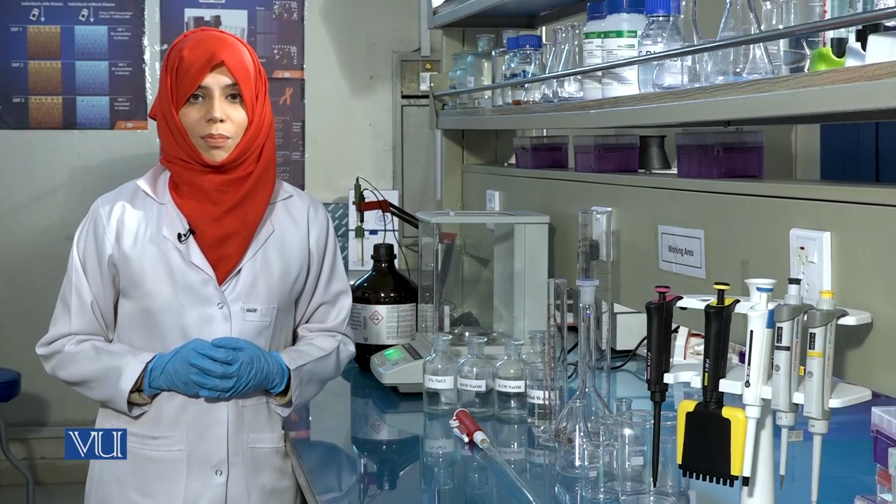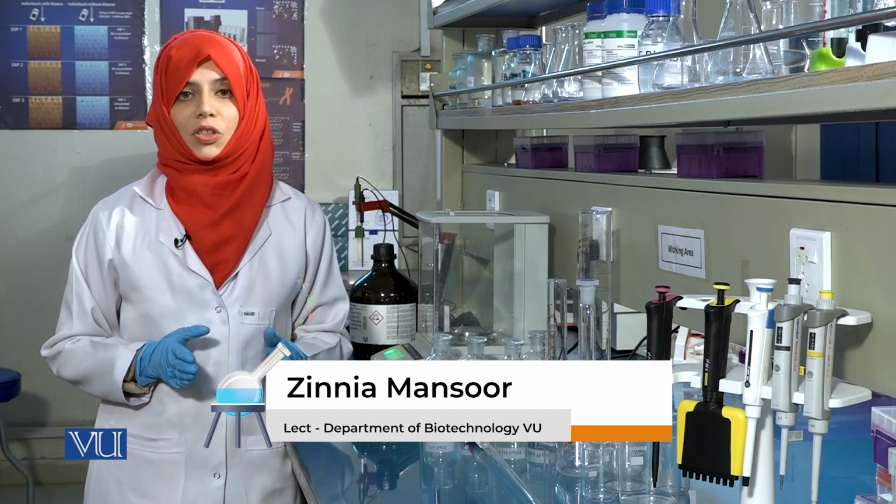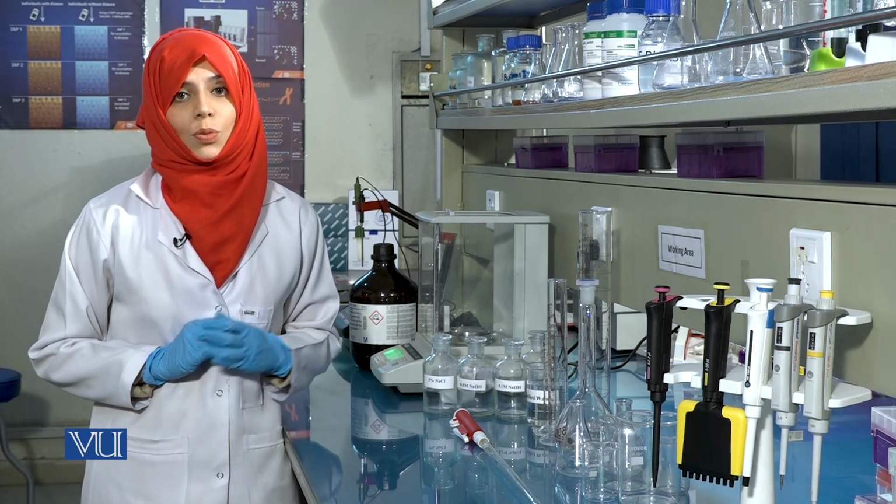Dear students, most of the reagents used in the scientific laboratory are in the form of solutions that need to be prepared or purchased. For some cases, the exact concentration of the solution is not important, while for other cases, the concentration and the method of preparation of the solution needs to be as accurate as possible. Today, we will learn how to make solutions in the laboratory. But before that, we need to get acquainted with the glassware used for this purpose.